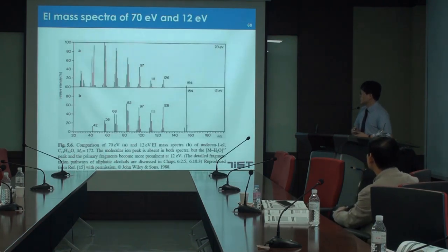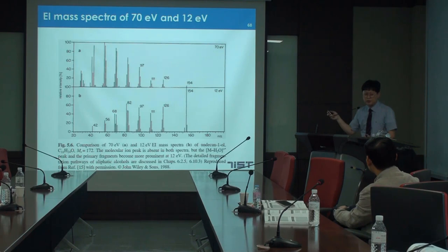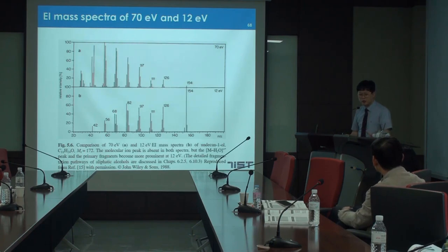This is an example of an EI mass spectrum at 70 electron volt potential. This is the energy of the electron impact. This is the general option, 70 electron volts. All GC-MS instruments use 70 eV. Any chemical impacted by this electron energy shows stable, very constant fragmentation patterns, whatever the instrument. So this is the general option.